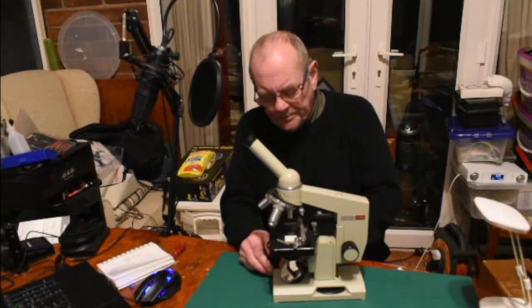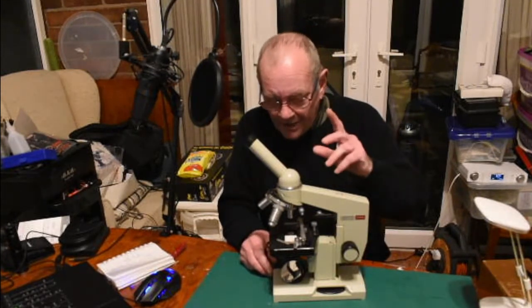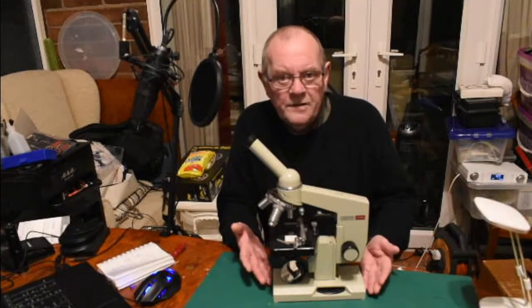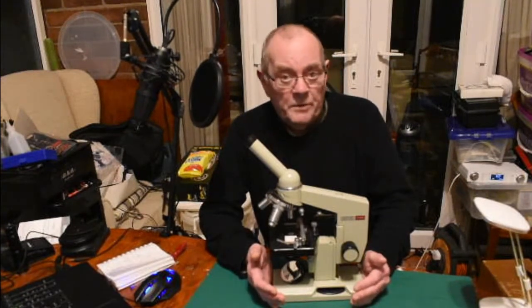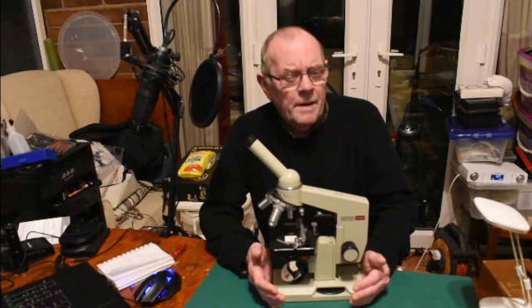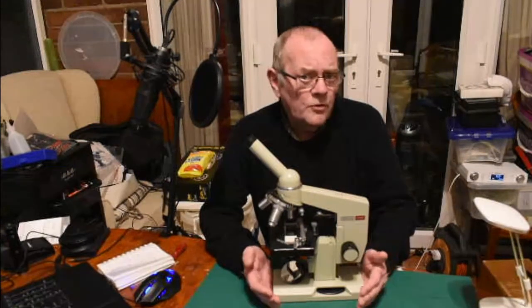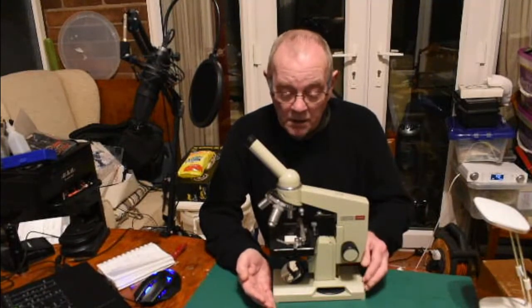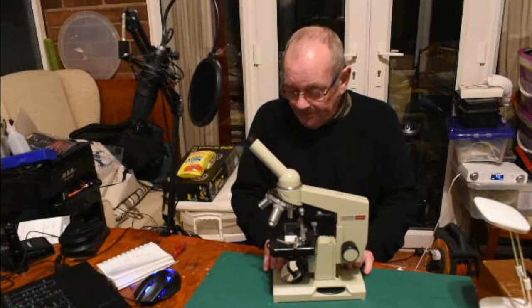Going back to prices — if you want to buy a decent microscope brand new, I think the cheapest one I would buy is about 250 pounds, and that's a Chinese microscope marketed by a company called Swift of America. You can get the same model under different names, but I'm not sure what the quality control is like.